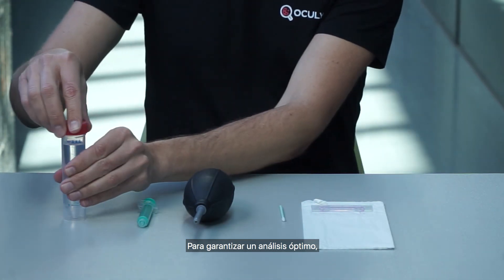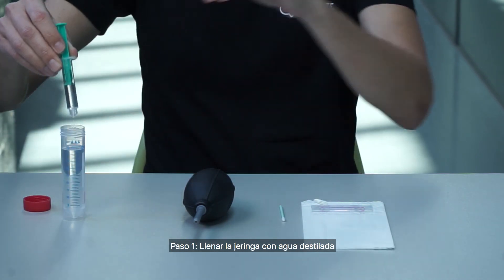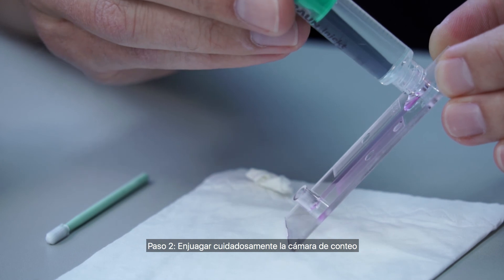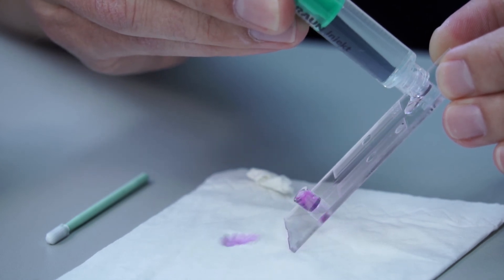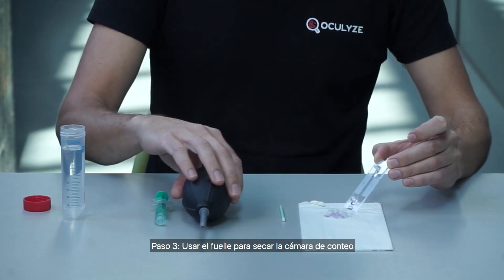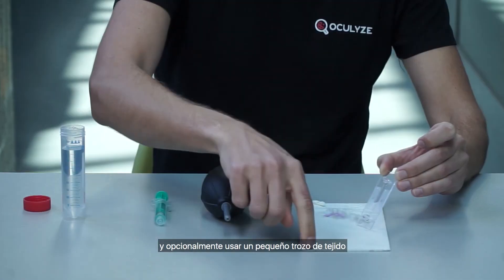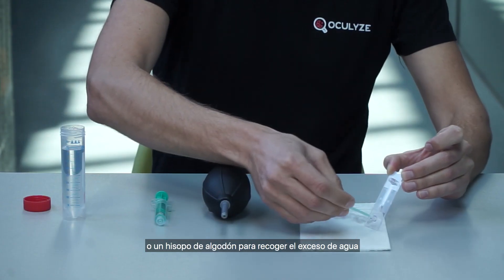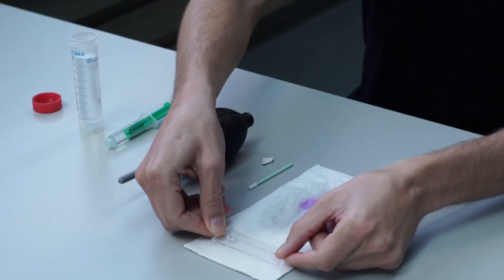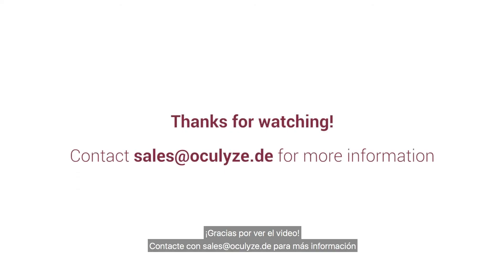In order to guarantee optimal analysis, the chamber must be cleaned and dried immediately after each use. Step 1: fill the syringe with distilled water. Step 2: carefully rinse the chamber. Step 3: use the bellows to dry the chamber. Carefully blow air through the chamber and optionally use a small piece of tissue or cotton swab at the end to collect excessive water.